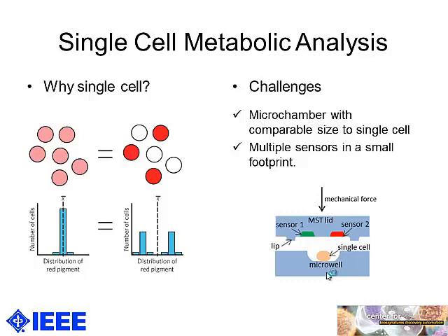To reveal the actual mechanism requires analysis at the single cell level. The single cell analysis allows the individual expression studies, which is not limited by the averaging effect from the bulk population, and helps to understand the behaviors of the individual cells when they interact with their local microenvironments.